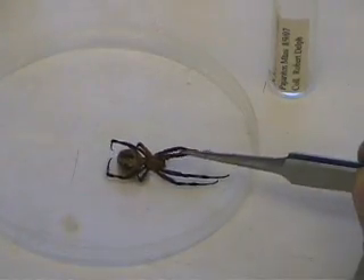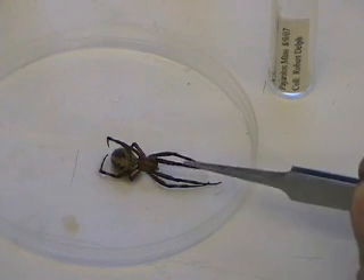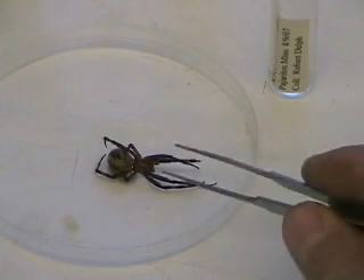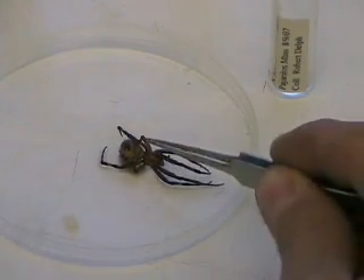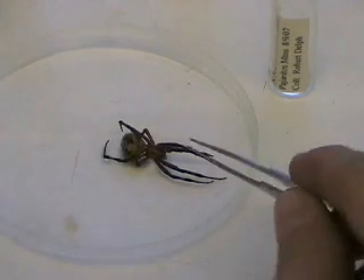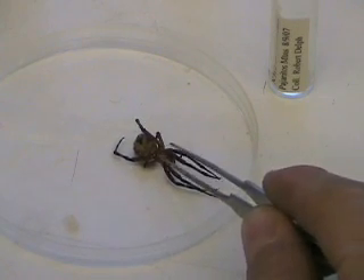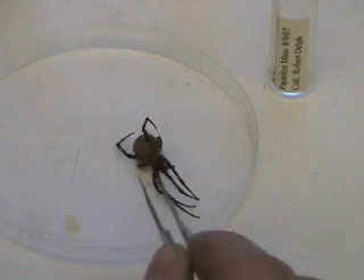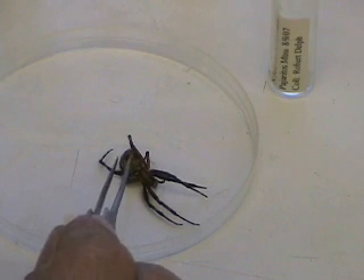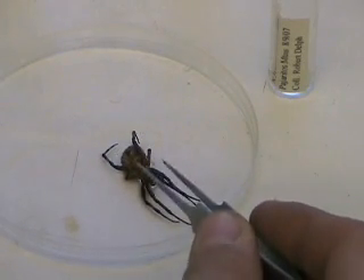Here's a spider. Whenever you're doing collections of insects, almost everywhere you find insects you will also see spiders. Spiders are one of the most common non-insect arthropods you will encounter. For preserving spiders, they are a non-insect — they're an arachnid with eight legs. You can see here's the cephalothorax and here's the abdomen. When processing arachnids, they need to go in ethanol. If you were to pin or dry this specimen, the abdomen — usually the softest part of the spider — will dry up and shrivel like a raisin.